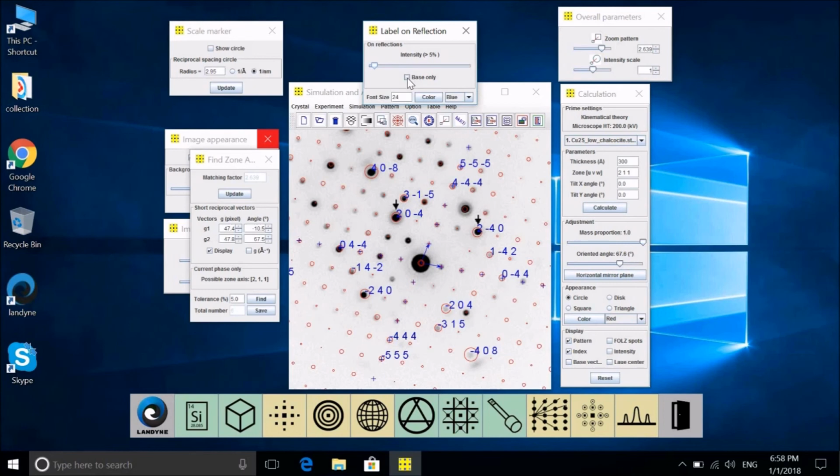Or you can simply go to the basic one. So we got this one indexed, and also this one indexed. And inside of this one will be its reverse. And we got a number here, -1. I can show you maybe in yellow or other colors.